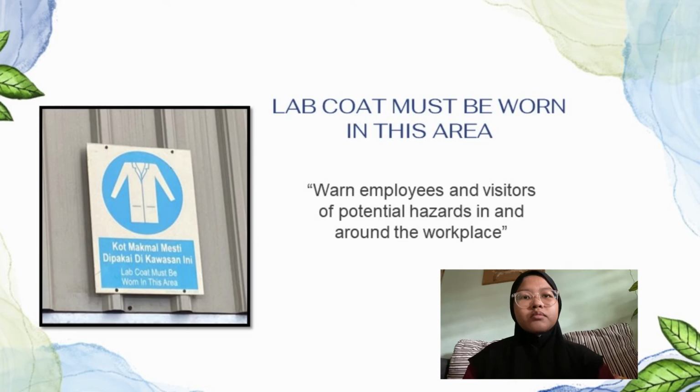laboratory coat. Number 1 is work in laboratories. Number 2, handle biological, chemical and radiological material and waste. Number 3 is handle human blood, tissue, cell lines and other potentially infectious material. Number 4 is handle clinical specimens. All laboratory workers are responsible for following the requirements for wearing and properly maintaining a lab coat as outlined in this policy, guidelines and laboratory-specific safety training.